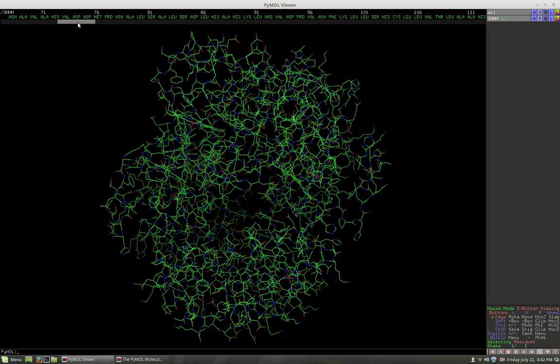You can scroll through these, and you have quite a few to look at here. Now SO4 is basically telling you this is the end of this particular protein. So we have more than one.